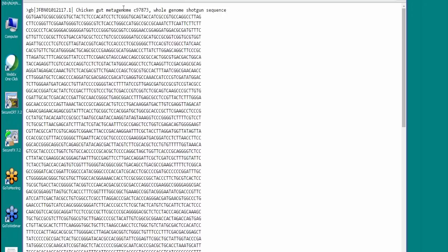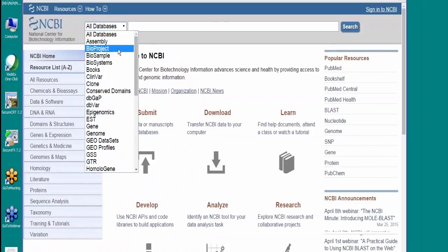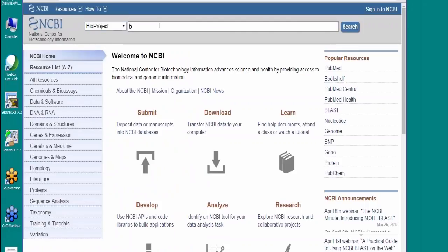And it definitely looks like it's in the Bifidobacterium genus, but I don't think we actually have a genome that corresponds to this one. Last thing I want to show you, and then we'll have time for a couple of questions, is the new service that we call MoleBlast. So in order to use MoleBlast, I need to get a set of sequences, and I'm going to have to resort to BioProject again to do that. So I'm going to go back to the NCBI homepage and pick BioProject, and these are going to be ones from the cow. So I'm going to use a bovine gut metagenome.